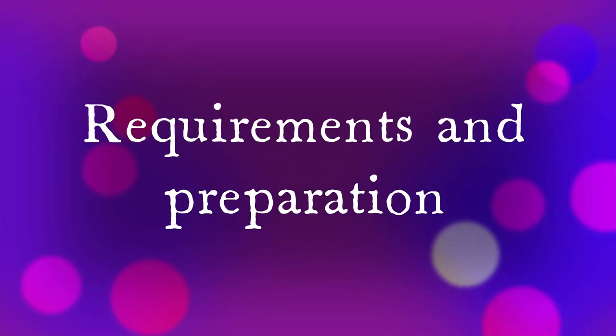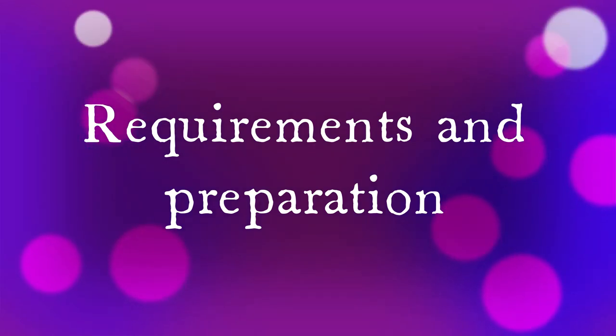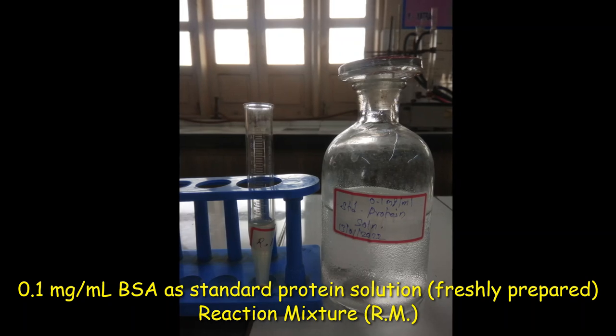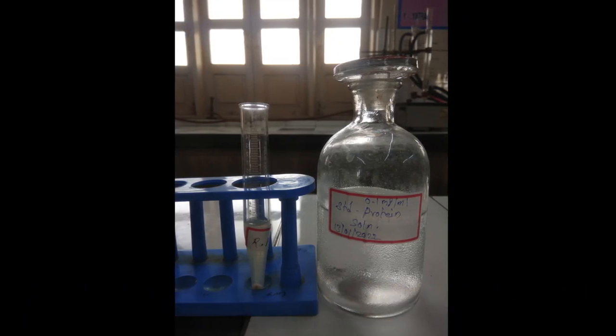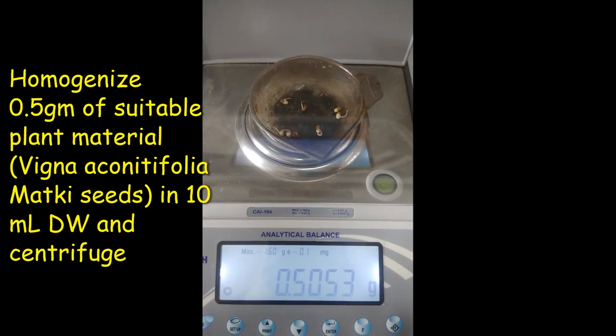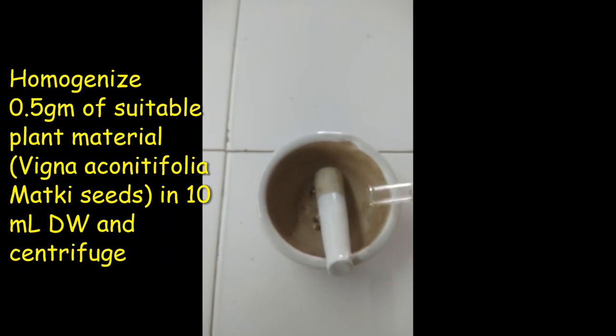Without wasting time, we will have a look at the requirements in the preparation of the chemicals. Freshly prepared standard BSA solution 0.1 mg per ml and reaction mixture. Reaction mixture is nothing but a suitable or desired extract prepared to study.